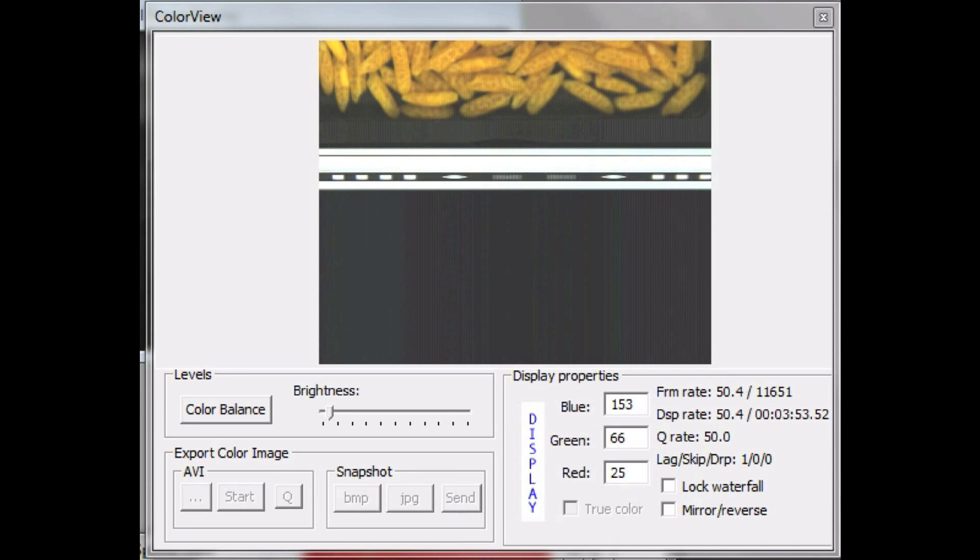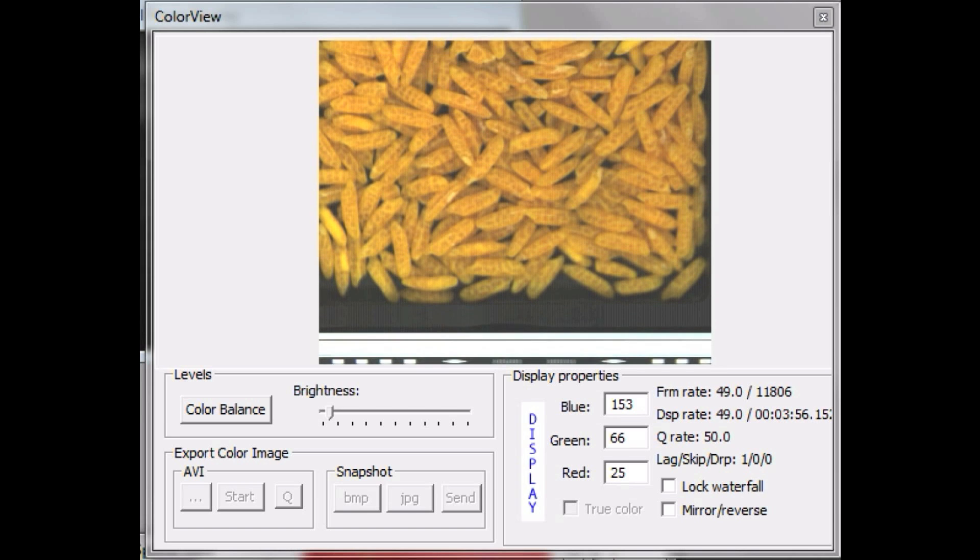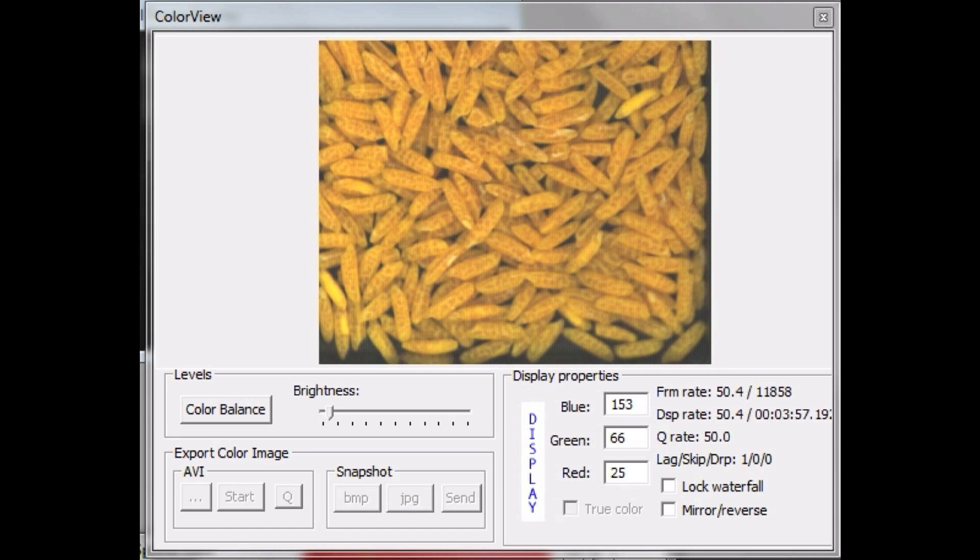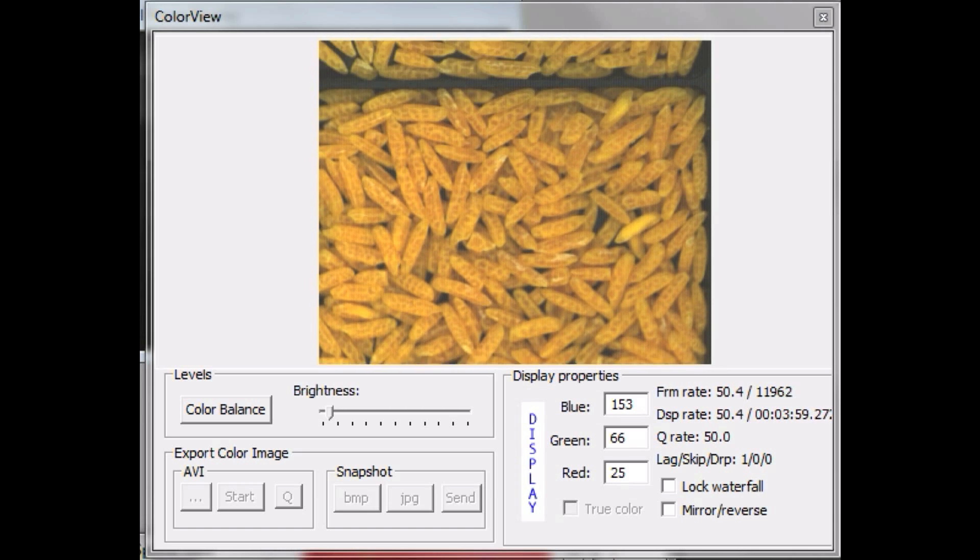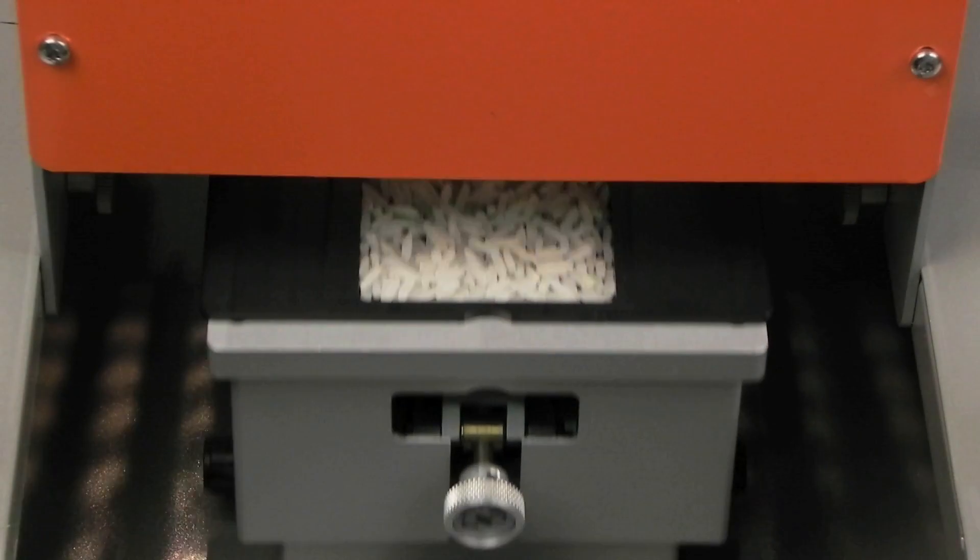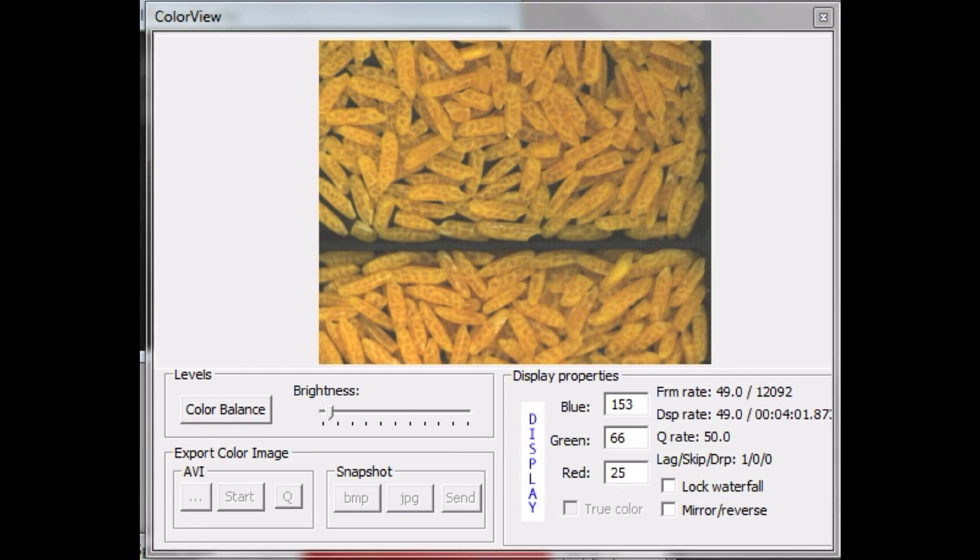Scanning automatically takes required dark and internal white reference images and scans the surface. You can monitor the scanning real-time on screen.